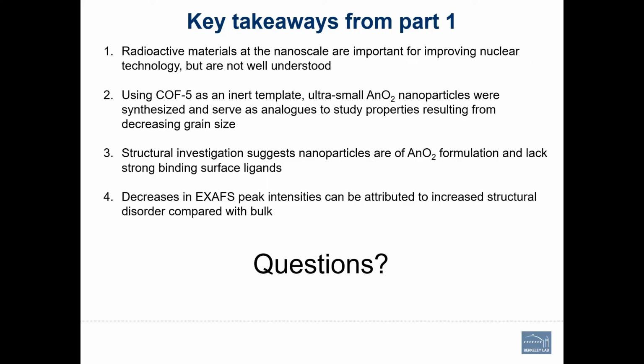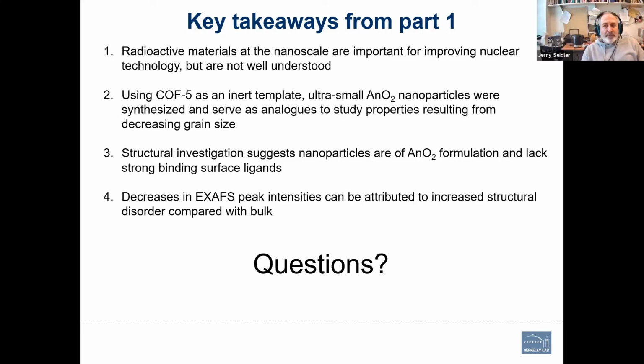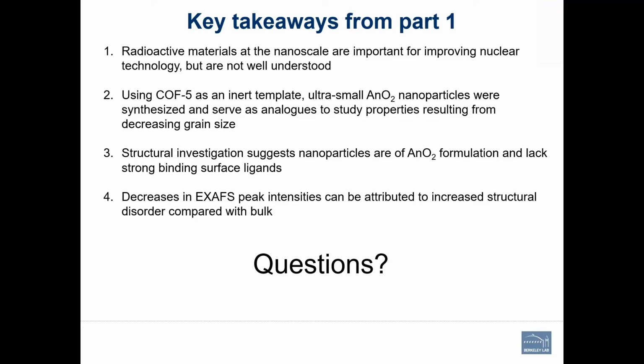Okay, great, thank you. Okay, last question from Satish Maneni. Yeah, pretty nice talk. I'm just looking at your STXM data and your XAFS data. And the STXM data shows that you have a lot of carbon, fluorine, and so on in the nanoparticles. And I'm wondering how pure these are?